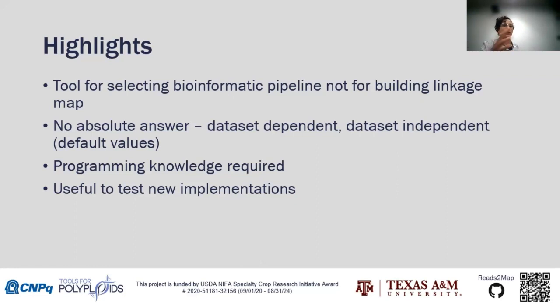These I turned into default values in the workflows. In the template of the inputs, you will see that some of them have a default. That's why I call them data set independent. They probably will not change for your data set. I try to do that to reduce the number of tests that users need to do.